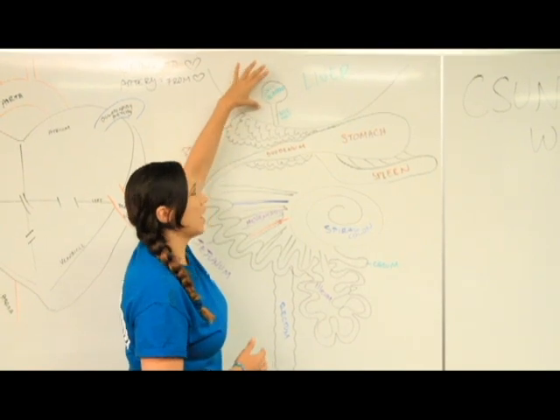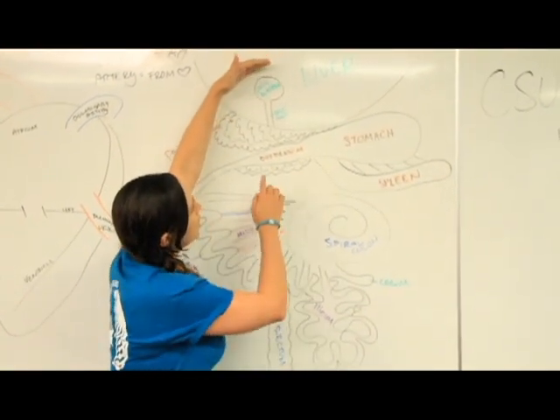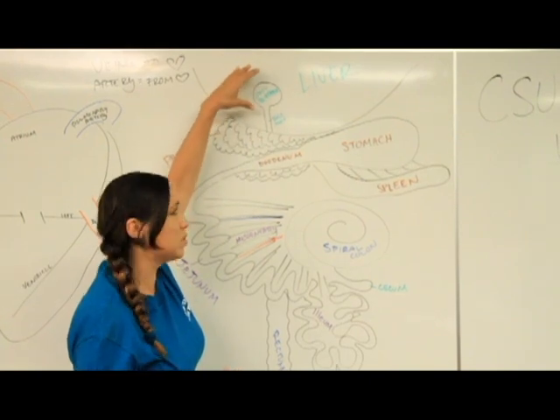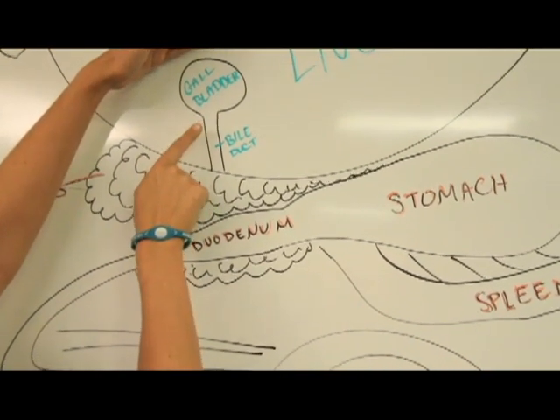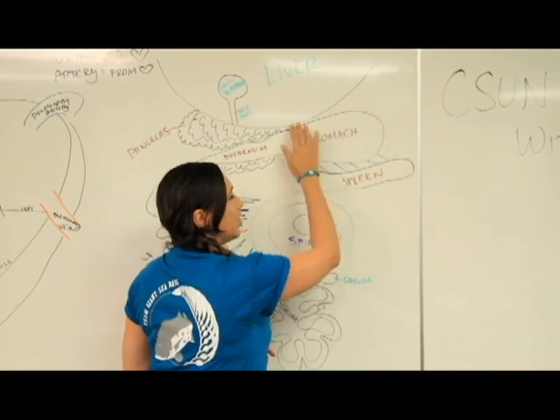And this is going to be on the right-hand side of the liver, and that's the pig's right, not your right. Underneath the liver, we're going to have this tiny little deflated sac, and this is going to be the gallbladder. And that's because the liver produces bile and the gallbladder stores that bile. So the bile duct is actually going to be this tiny little tube coming out of the gallbladder, going down towards the duodenum.